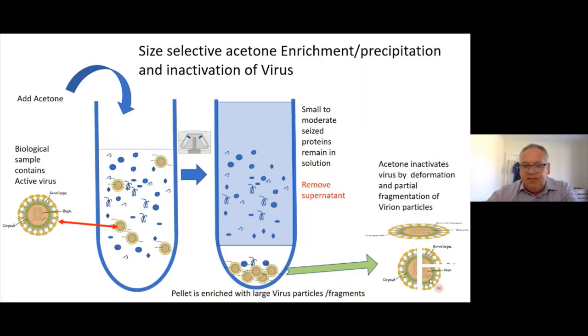And if you're worried about it, in a class 2 it's much safer to actually deal with these viruses.